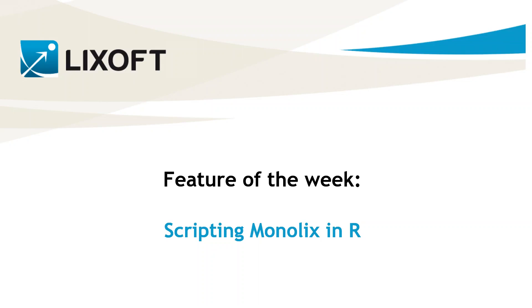Sometimes you might not want to use Monolix through the interface, but with scripts. This is the case, for example, if you want to automate a set of actions in Monolix. The Monolix suite comes with an API for R that allows you to use Monolix and PKanalix from R, which means that all you can do with the interface can be done with the API. Let me show you some examples in this video.